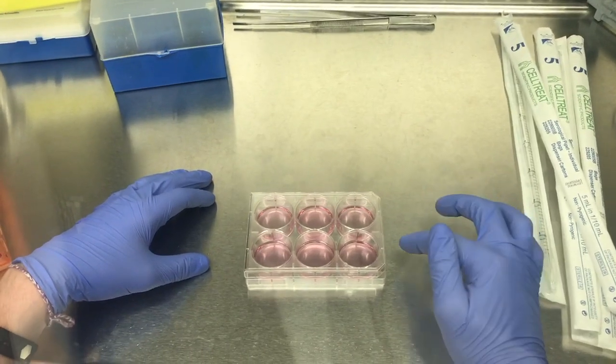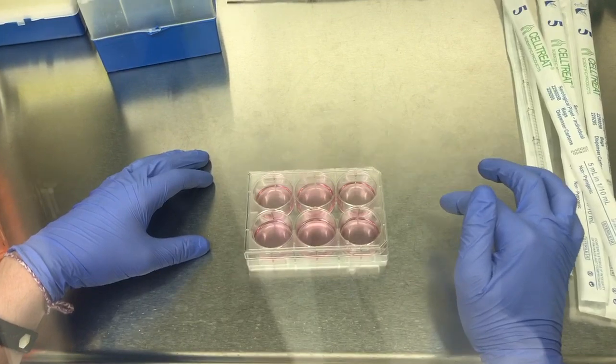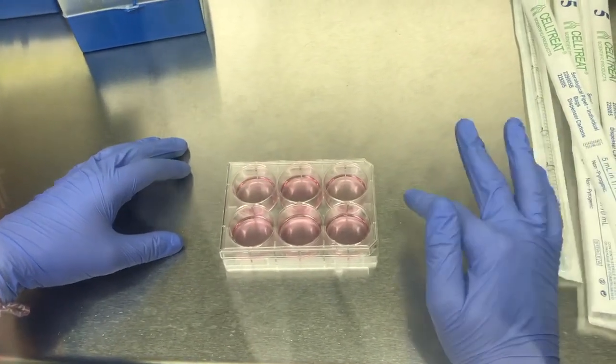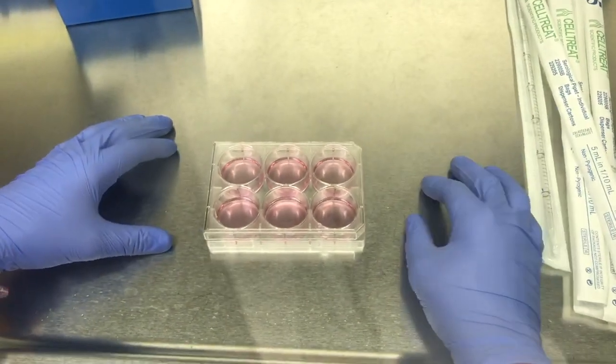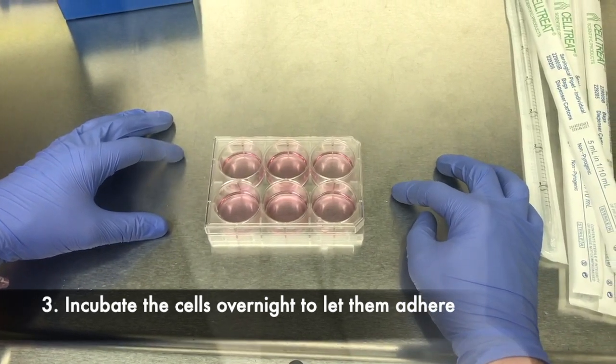Now that I've done this, make sure that you leave the lid on the well plate as often as you can, just to minimize contamination from the air and outside sources. These are adherent cells, so I'm going to stick them in the incubator and let them sit overnight.